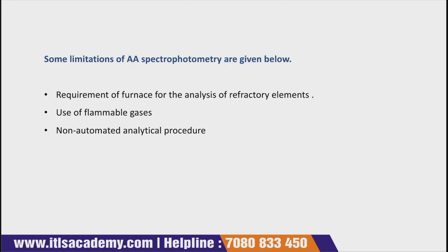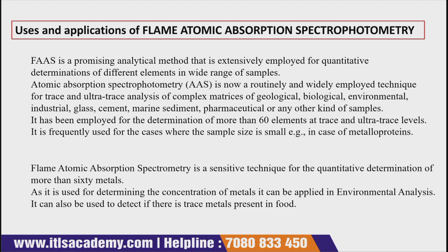Now if you see the application part, the uses of flame atomic absorption spectrometry, it has a huge demand in every sector. How come?